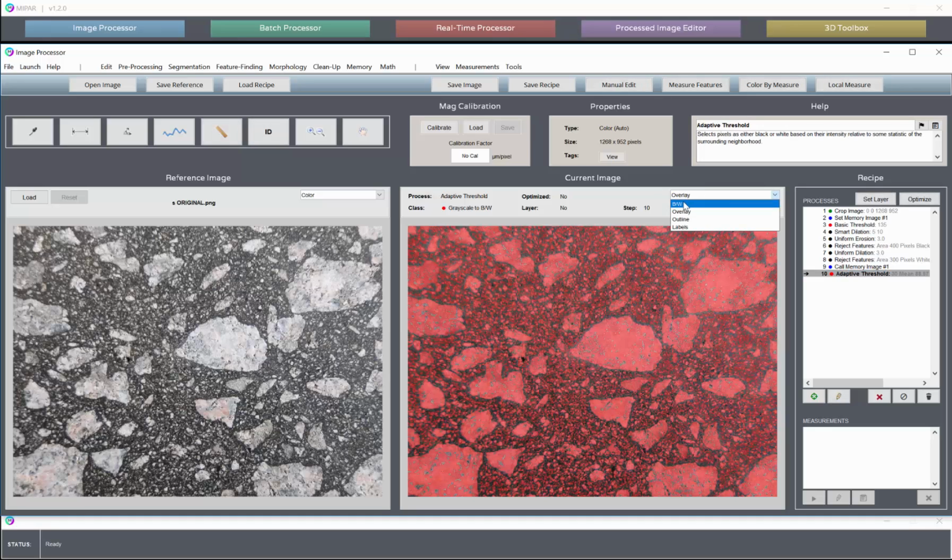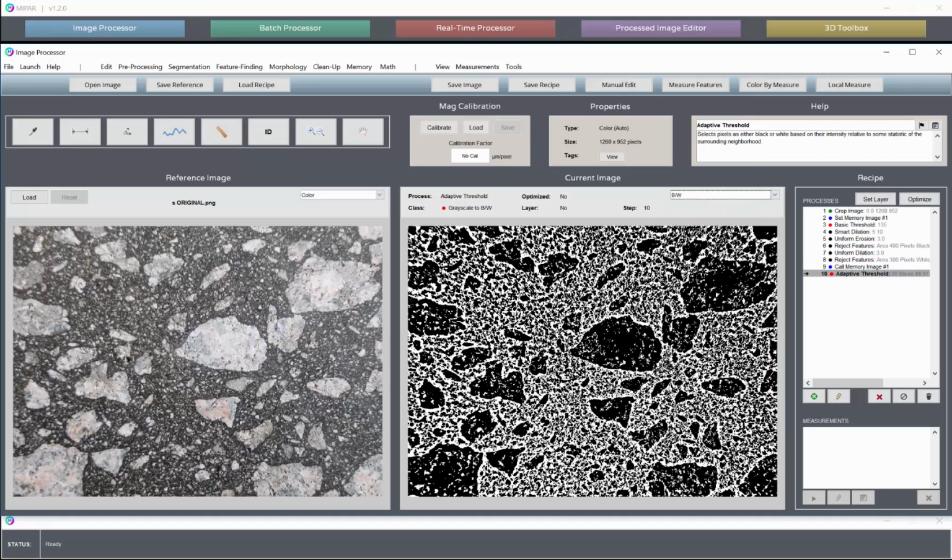Let's just suppose we did something like this. I won't do any cleaning up or separating on the fine features because this tutorial is just to indicate or illustrate the use of the memory steps, not so much this particular segmentation problem.